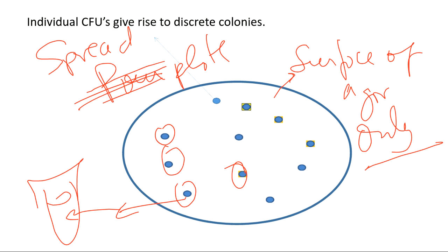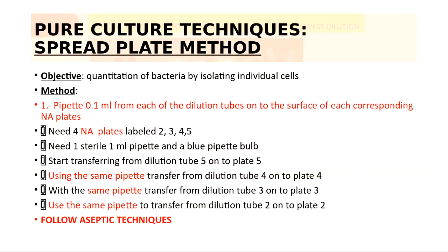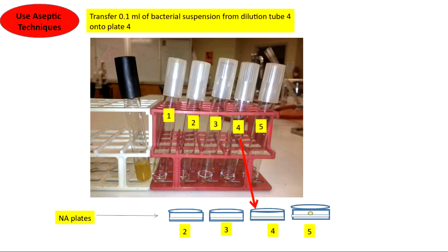And let me show you how that's done. And I'll repeat all these since I kind of messed it up. The dilutions are the same. You made the same dilutions exactly the same way. As a matter of fact, in the lab, we use exactly the same tool. So we only dilute once, and we use it for pour plates and for spread plates. The difference is, in a spread plate, you're going to be using a plate that already has agar in it.